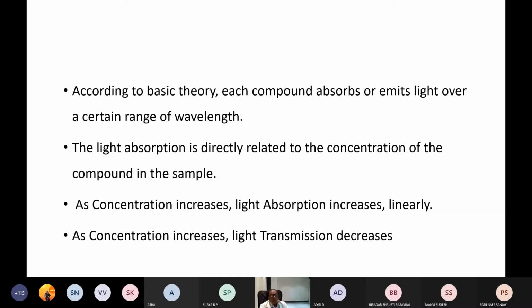So it should be maintained there that as long as the concentration increases, the light absorption also increases. In case the concentration is too high and the light absorption by the filter fails to be recorded, then you will be compelled to dilute the concentration and set it in such a fashion that it can be read with the provided wavelength.